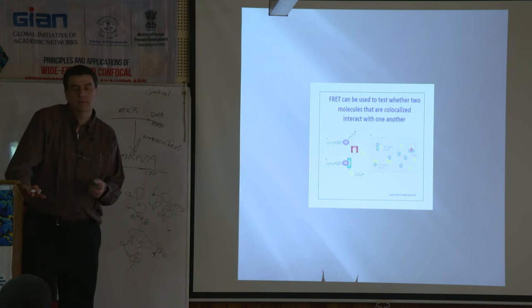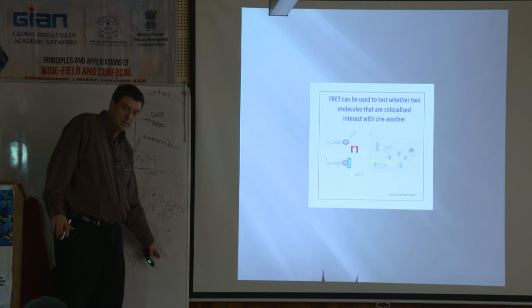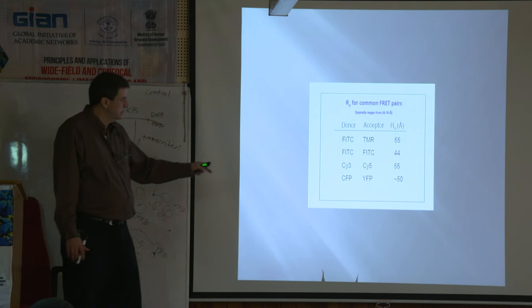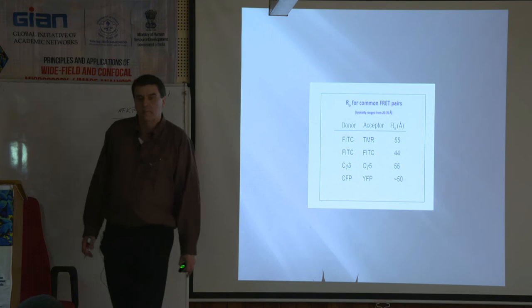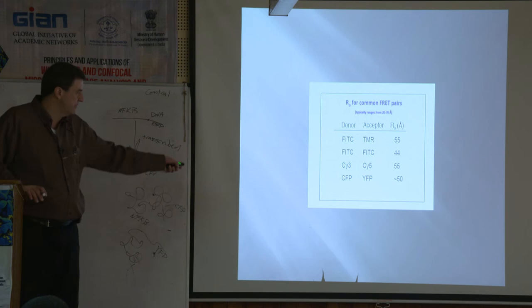Unless Y has a tag on it, it won't work. You have to have the system set up where you have a FRET pair to make this work. If you wanted to test Y, you could bring in Y. You'd have to build another one with, say, maybe YFP stuck to it. But you'd have to create that molecule. It's not like Y is just going to excite on its own. You have to build it into the system.